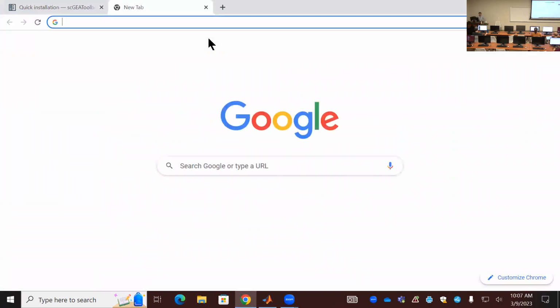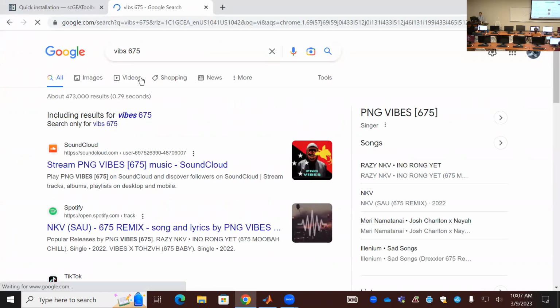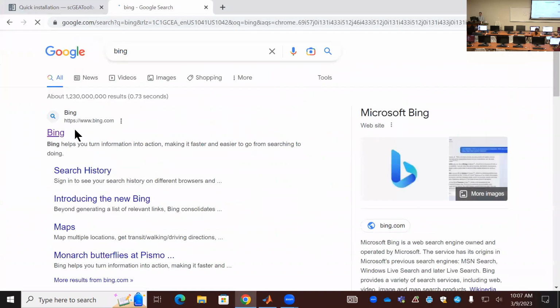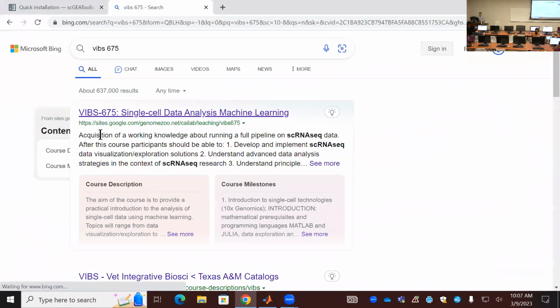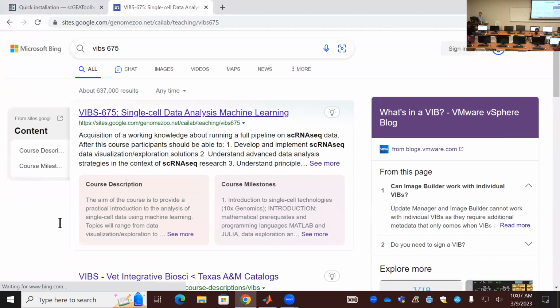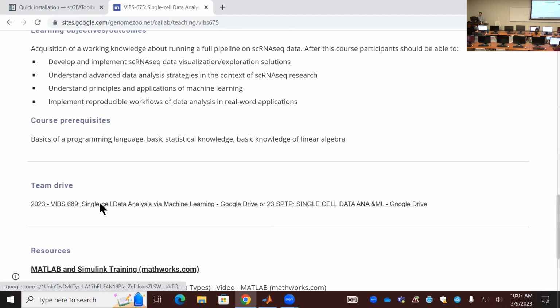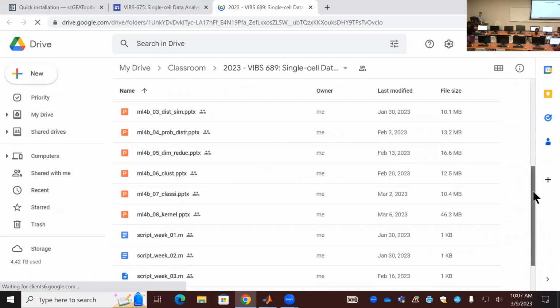So what you can do, let me, on the web page, I will use the example in the PowerPoint slide.